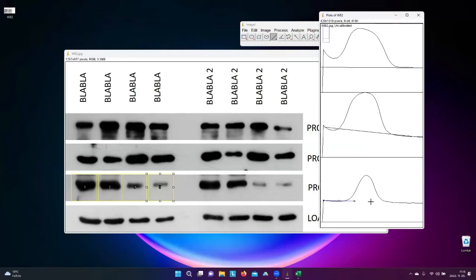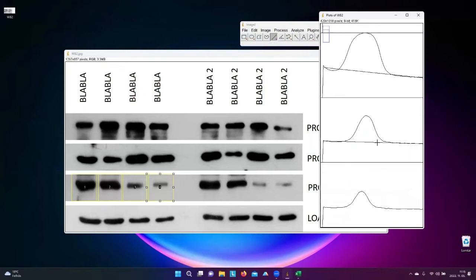It is not going to work. And also here. Or if you scroll down, oh, that would be easy, right? That's amazing. But the problem with this one, that as many lines you are using, as many mistakes you are going to generate. So in that case, that is not really efficient and accurate regarding the analysis.